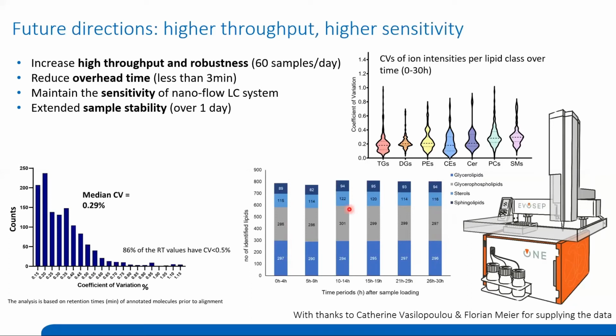And in addition, if you look at the intensity, so the abundances of each of these lipid classes, then this also remains stable. So this is where we see the workflow heading in the future.